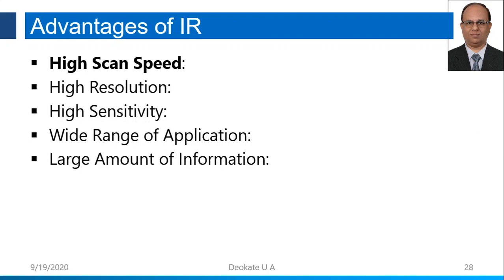Okay, a large amount of information we can get from infrared spectroscopy, because a lot of structural information of the analyte, such as type of compound, functional group of compound, stereoscopic structure of compounds, the number and position of substituent group, and so on.